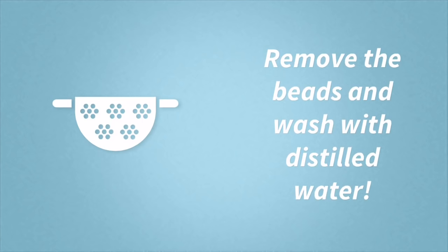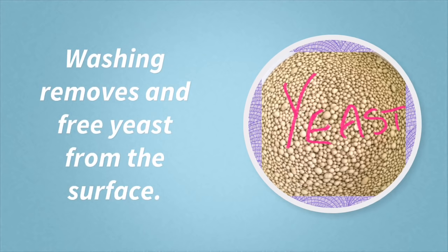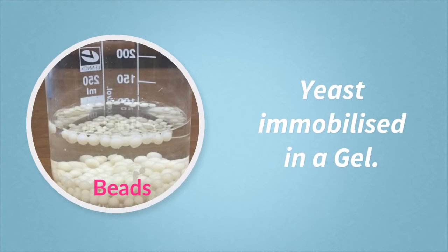The beads were removed from the calcium chloride solution and washed with distilled water. Washing with distilled water removes any possible free yeast that might be on the outside of the beads. So that was how we immobilized our yeast cells in a gel.